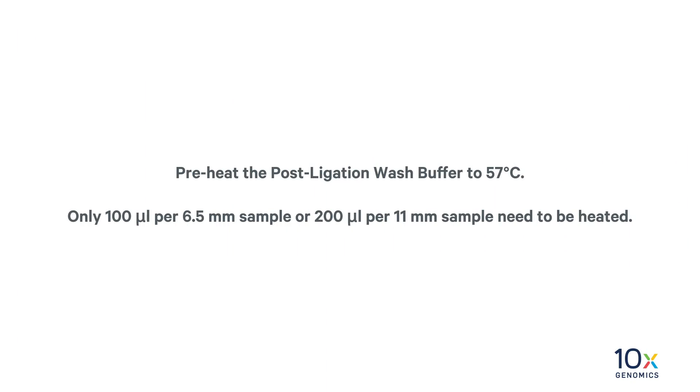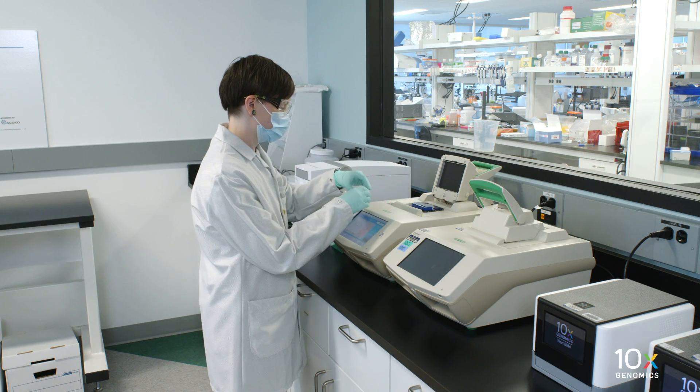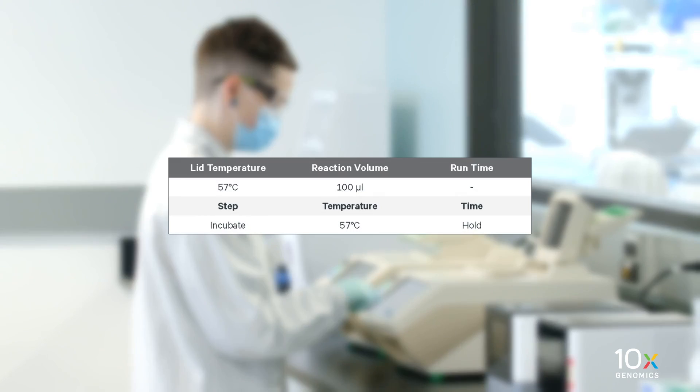Finally, we will perform the post-ligation wash. Preheat the post-ligation wash buffer to 57 degrees Celsius. Only 100 µL per 6.5 mm sample or 200 µL per 11 mm sample need to be heated. Remove the tissue slide cassette from the low profile thermocycler adapter and place on a flat, clean work surface. Immediately prepare a thermal cycler with the following incubation protocol and start the program.